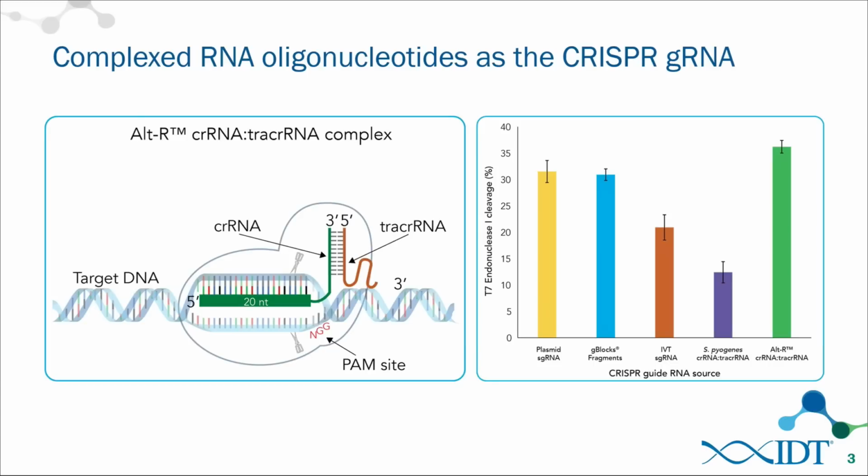Shown in the panel at left, just highlighting the synthetic oligonucleotide that comprises the crRNA or CRISPR RNA, as well as that comprises the tracer RNA. As I mentioned, the crRNA is a custom oligonucleotide. The end user would come to us with the 20 nucleotides or 19 nucleotides of specificity for genomic DNA, and then there would be an appended additional 16 nucleotides at the 3' end. As we've done the work to trim this down to a 36 nucleotide oligo, it represents one that we can reliably and robustly synthesize as a custom oligonucleotide.